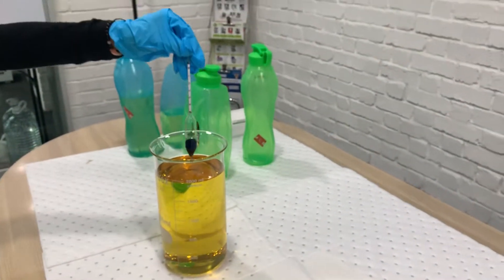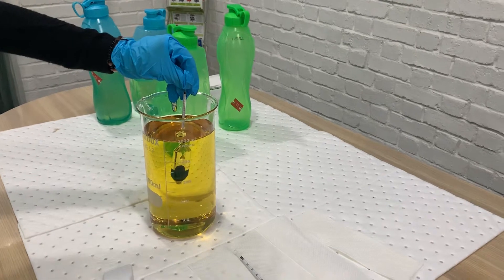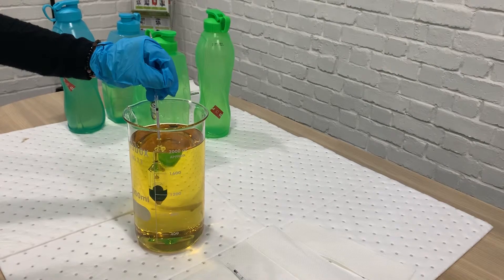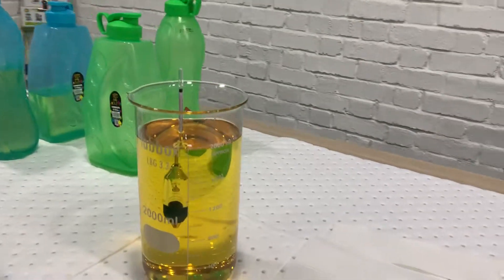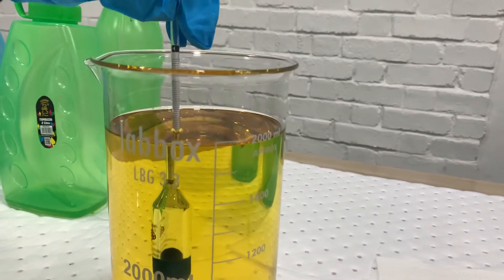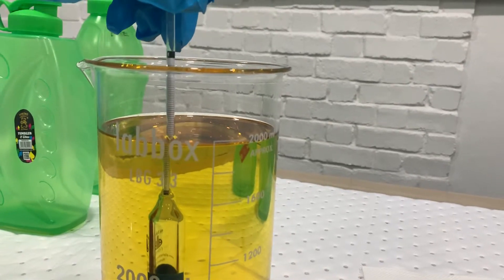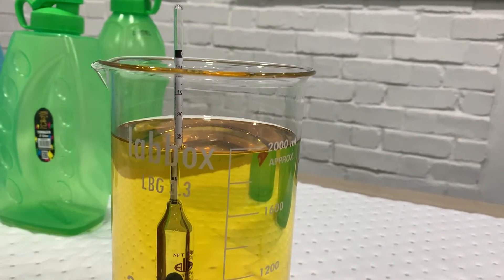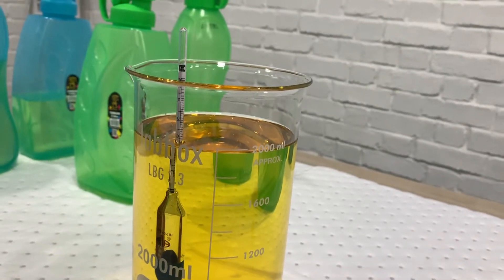Now we put the hydrometer inside the diesel and we start it. When it reaches equilibrium, we can take the reading of the hydrometer at the meniscus level. The reading is 0.832.